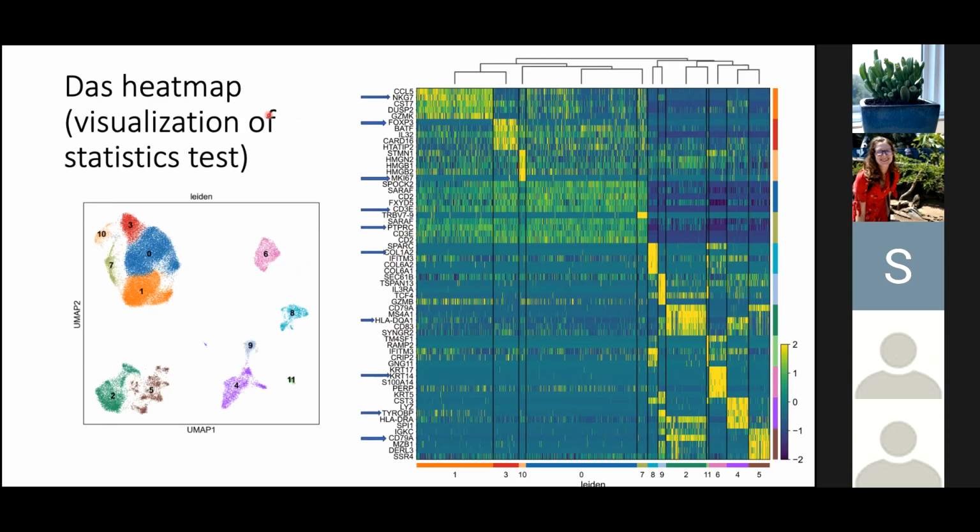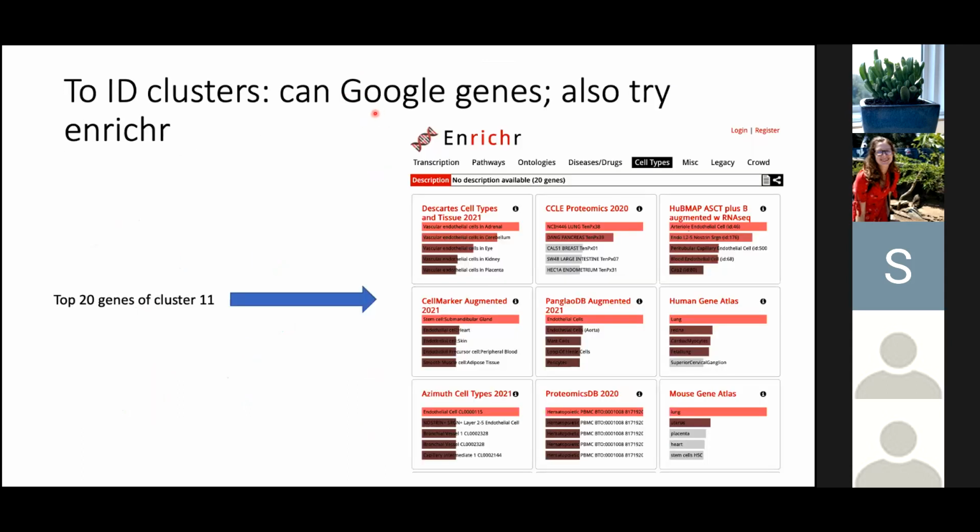Okay, so again, assuming that you don't know these marker genes, what you can do is take the differentially expressed genes and sort them by log fold change, which again, we know it's not super meaningful, but you can do this. What people suggest is to use something like Enrichr or gene ontology. You can Google Enrichr. We're going to talk about gene ontology in a sec.